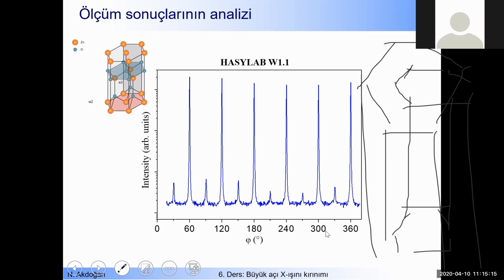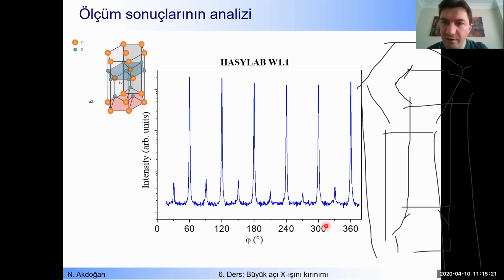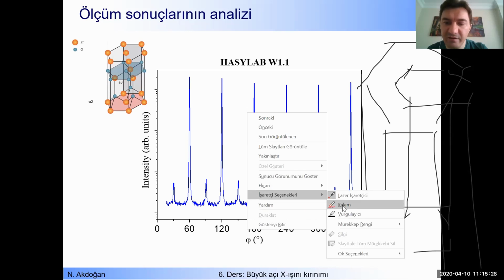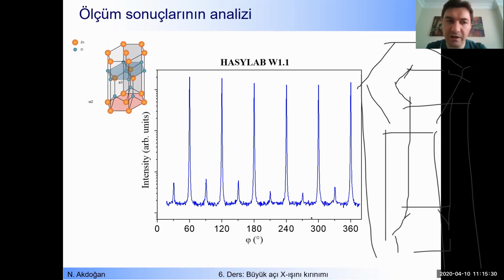If you are talking about lattice shrinking, you can consider that both D and A, lattice parameter and interplanar distance, must be decreased.